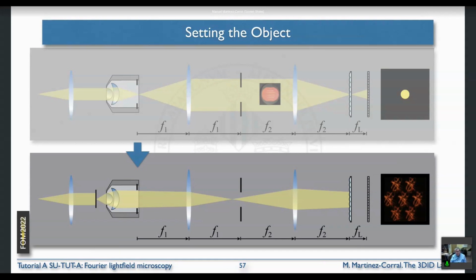So okay, this is blurred. So we can find when the image is sharp, and here we have many checkpoints. We have the sharpness of the image. We can check also how many microlenses are illuminated. So everything is now under control. So anyway, remember that I forgot to insert here a filter.